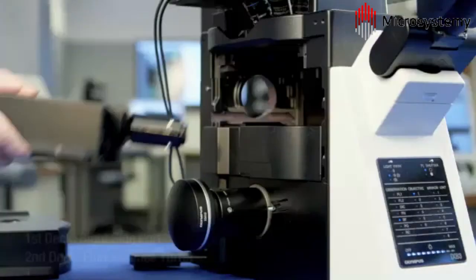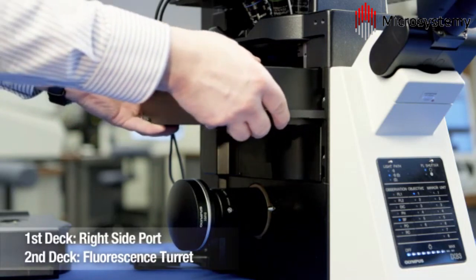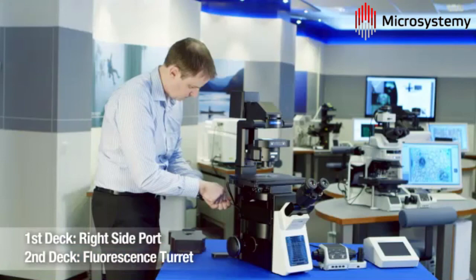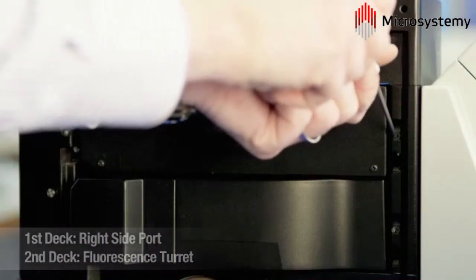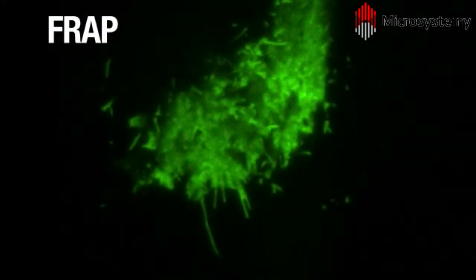The third Olympus module currently available is the right-side port for access to external components such as detectors and light sources. This allows an additional laser to be directed into the infinite light path for FRAP experiments, such as here, where photobleaching is performed together with image capture.